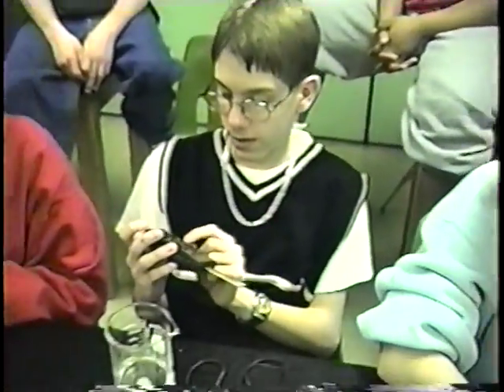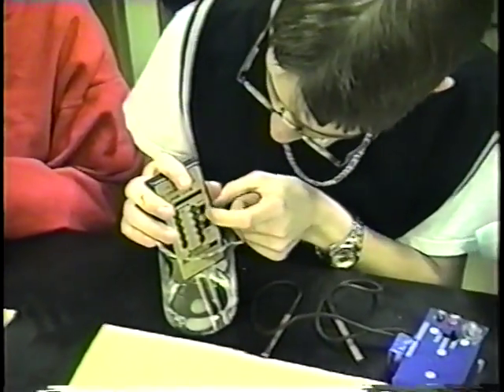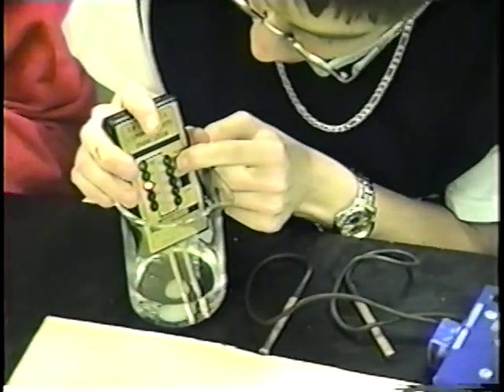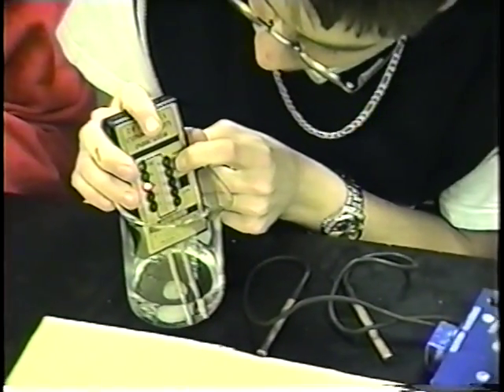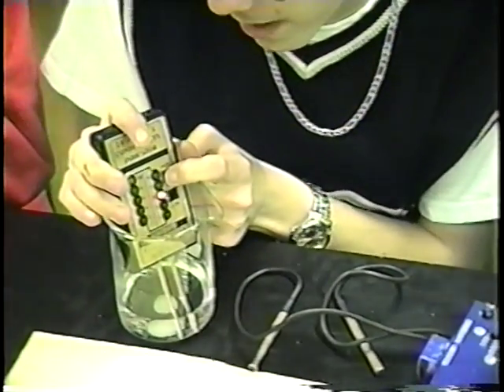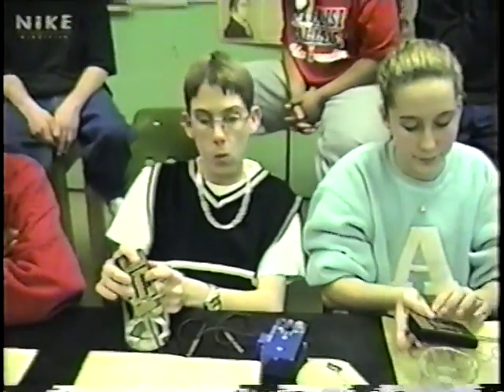Okay, now you've got sugar water, so put yours in, and let's see what your light comes up to be. It won't go in. You have to push the button. There it goes. And what light do you get coming up on that one? 6. Oh, it went down. Now what do you got? 5. So that's not a real high number out of 10. So it's somewhere at this point between weak and non. We'll have to do a further test on it.